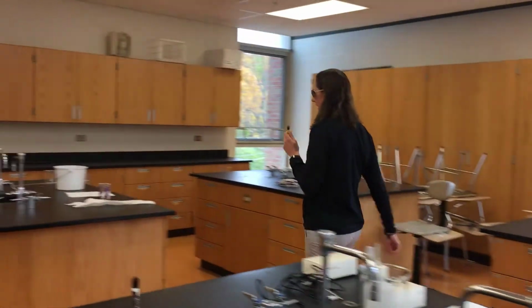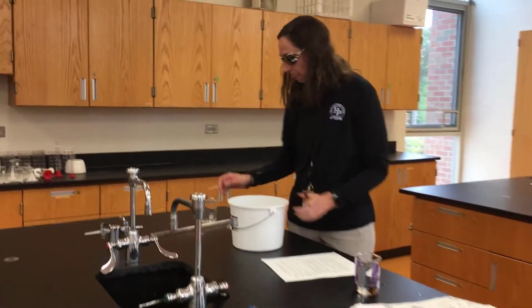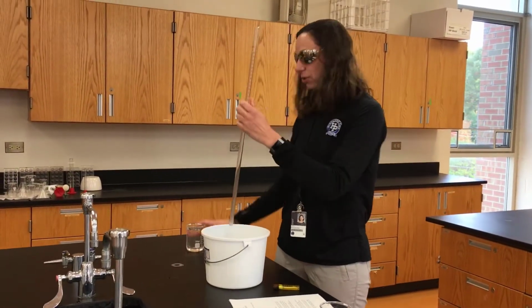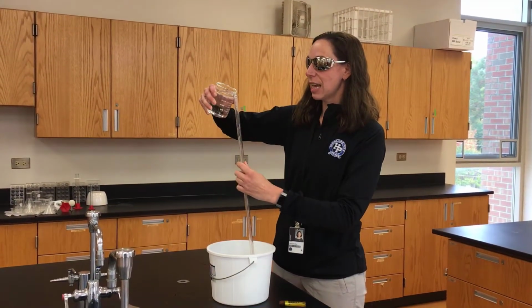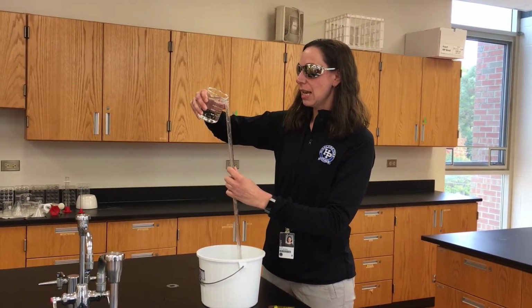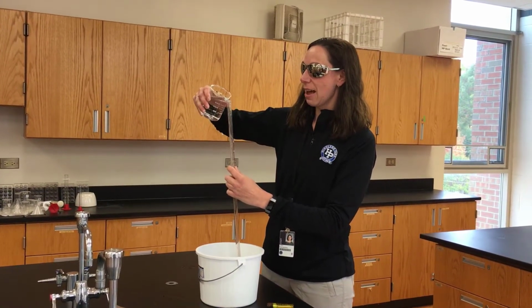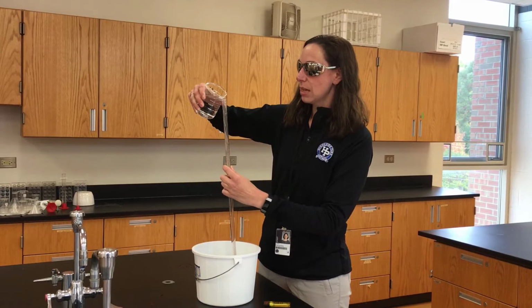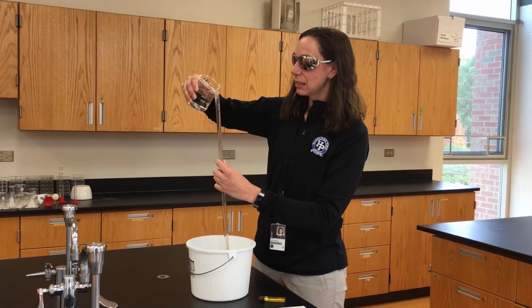And then what we're going to do is take this lighter to a bucket that's about half full of water. And what I'm going to do is fill a eudiometer. Some of you guys have used these before. This is kind of like a fancy test tube, and it has volume markings on it. But if you look at the markings right now, it looks like they're upside down. And that's because it's designed to collect a gas.